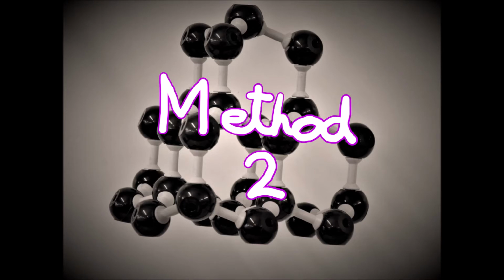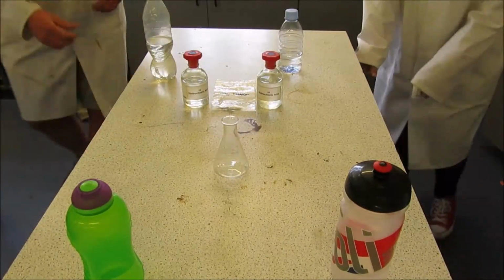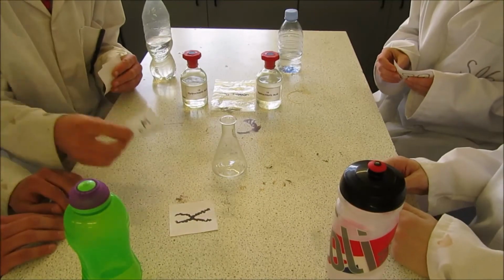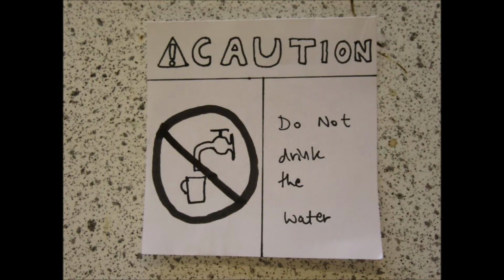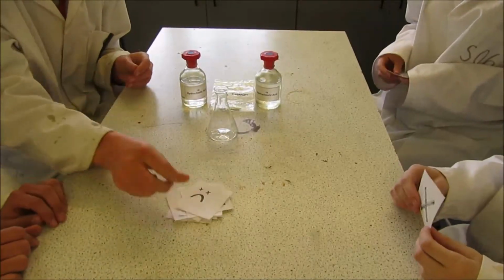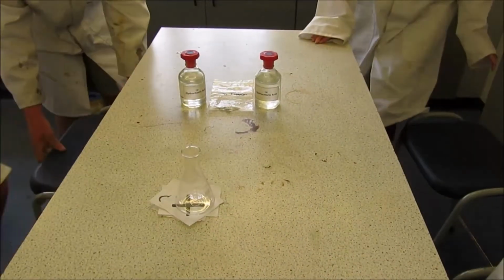Method 2. The disappearing cross. Now, set up your equipment as shown in the diagram. Ensure a suitable cross is drawn, unlike any of these. Caution! Do not drink the water. Placing the conical flask on the cross.